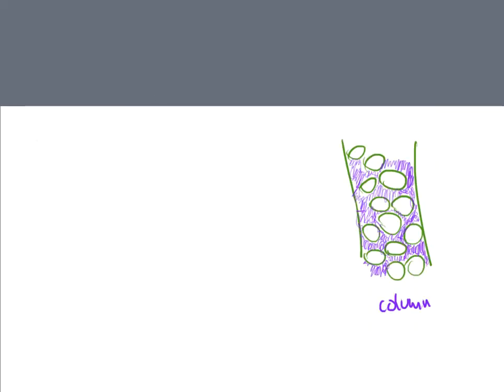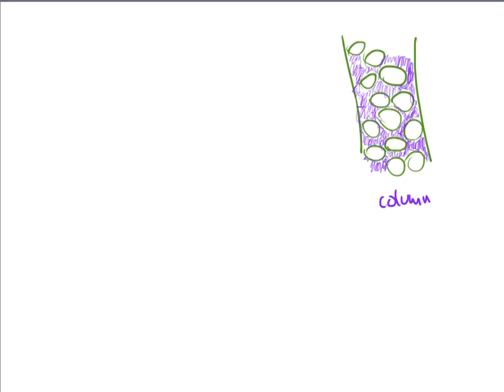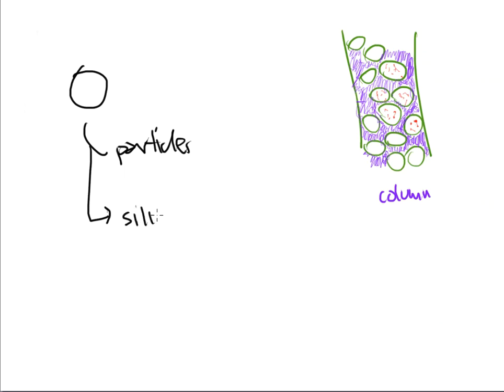So again, if I had to draw it out, there's your column over to the right-hand side, and that column's got particles on it. And those particles, well, it could be loaded all over the surface, and that could be ammonium, or that could be our sulfonate group. All right, so this particle, not the fingers that are hanging off, they're going to come to us in two different forms. Most of the time we have a choice in ion chromatography where we can choose silica particles, or we can choose a polymer-based particle.